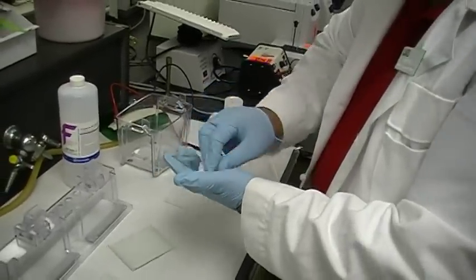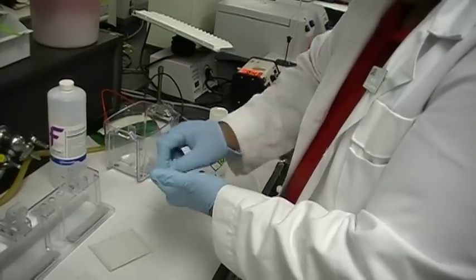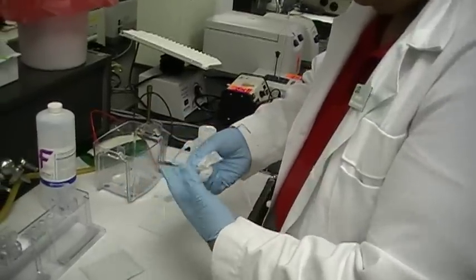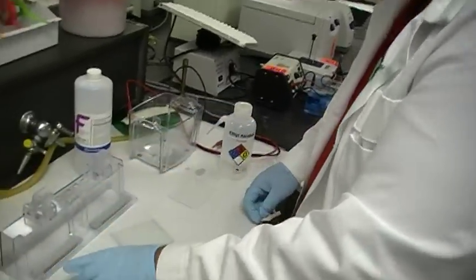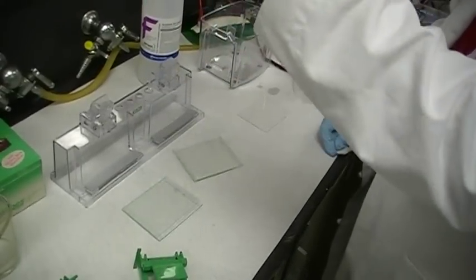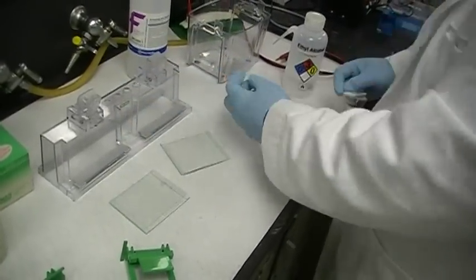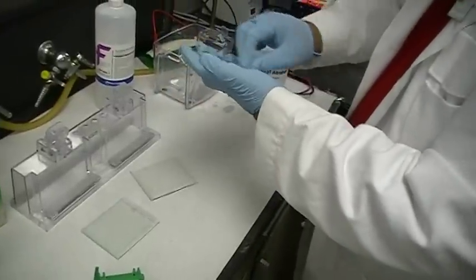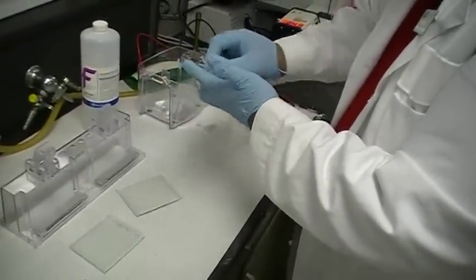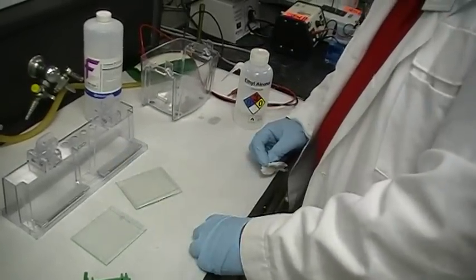Then you take two smaller, skinnier plates with no spacer attached, and you're going to use one or the other side. Since I've chosen to use this side right here, this is the side that I'm going to clean. Squirt some ethanol and clean it off with the Kim wipe. And then lay it on top of the clean plate face down — spacers facing up, clean smaller plate facing down. Take the other one, same thing. Wipe it off, clean it off, and lay it down face down.